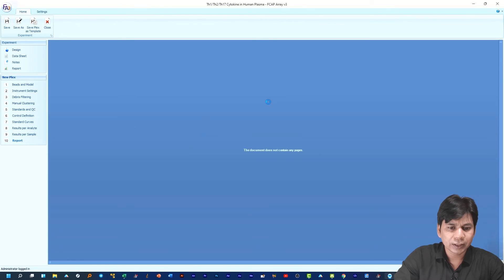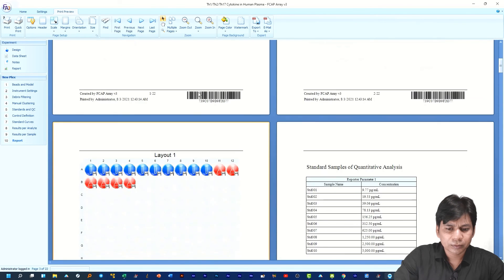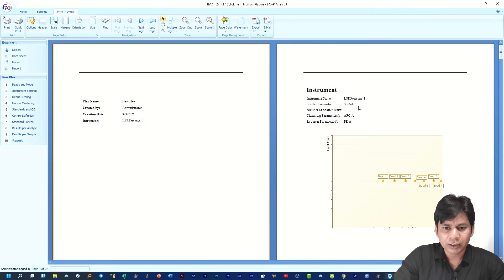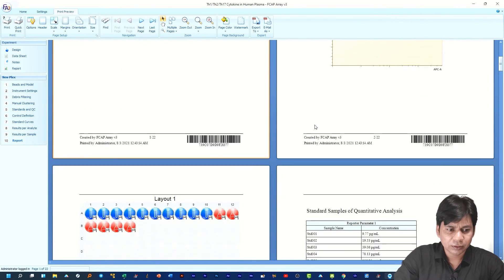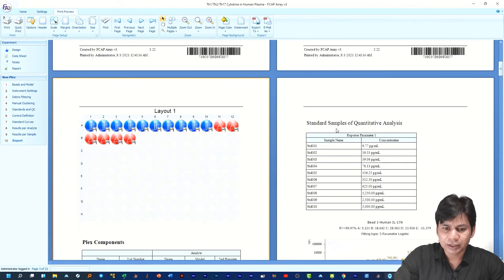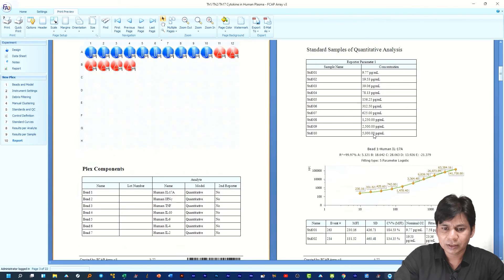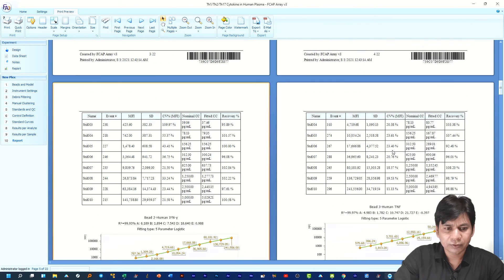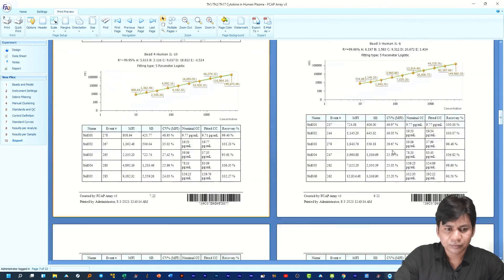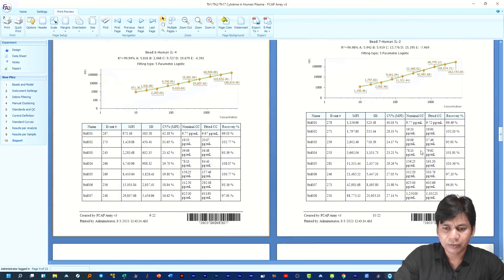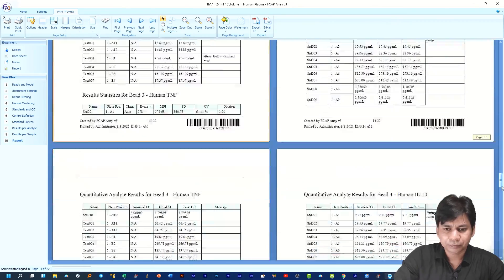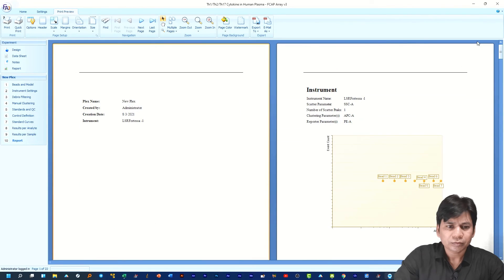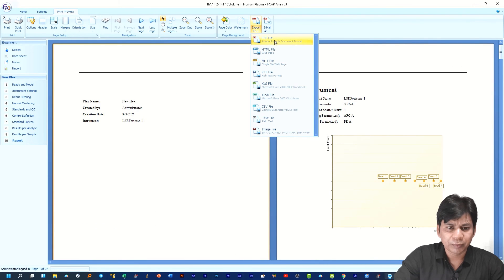If you click on 'Report,' you can see it provides all details including instrument information, layout, standard, sample, and quantitative analysis — all in one file, including the standard curve. You can export this report in PDF, Excel, or RTF format.